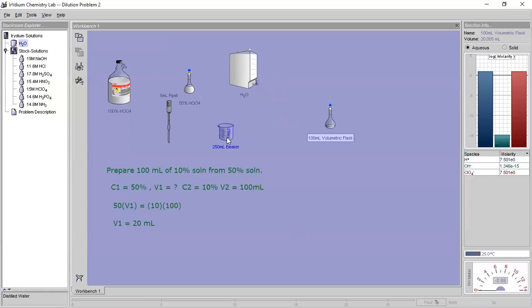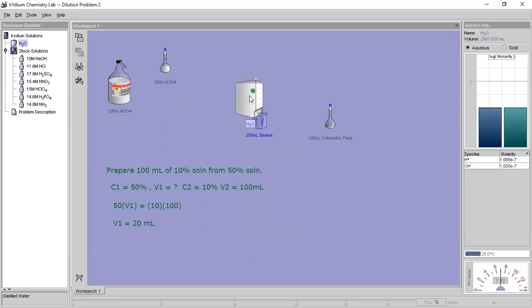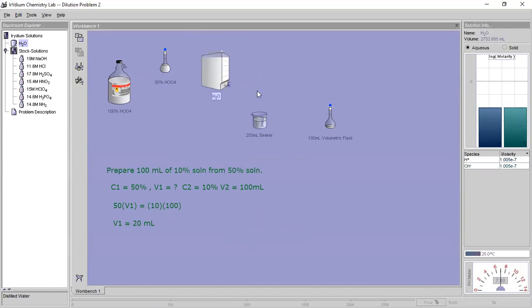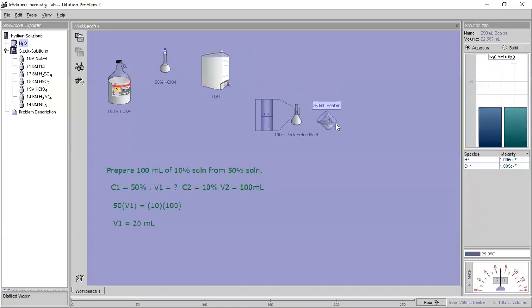So I'm going to remove a few pieces of glassware to clean up my bench. Beaker. So now we've got to add roughly 80 milliliters of water to this. This is where you want to be careful. So we have 69, 88. One more. Whew, 92. At this stage, you don't want to go over because you're going to have to start over.